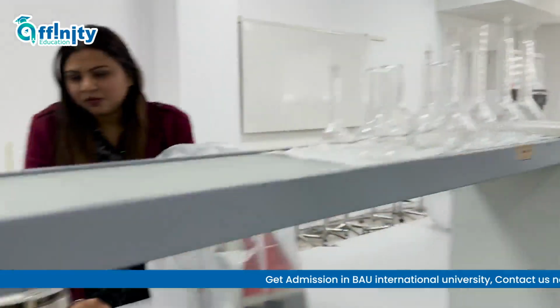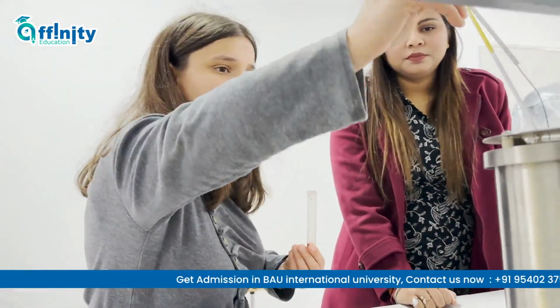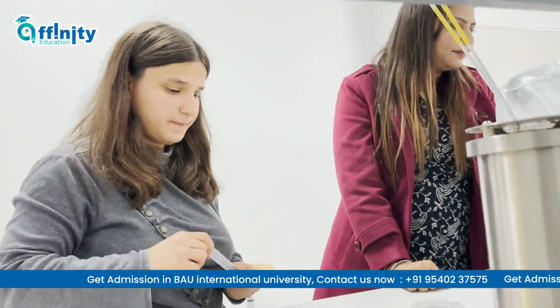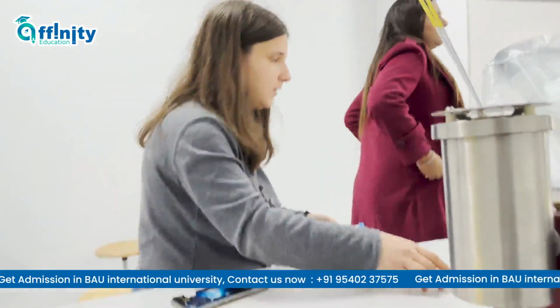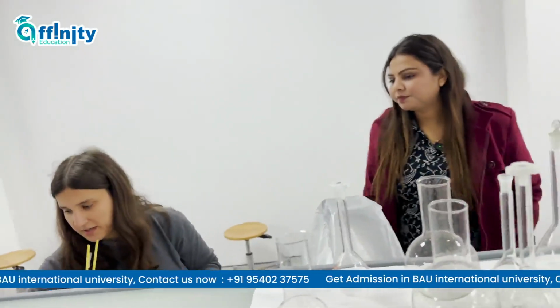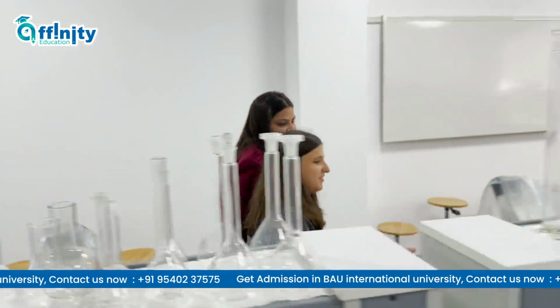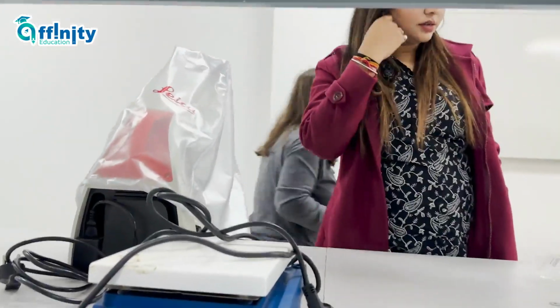And this one is for sterilizing, because here are microbes. We should put it here and sterilize it. And other different things. Yes, now as labs are not active, as everything is closed. This one is for mixing medium and for heating. Okay, for heating. This one, I said, is for sterilization.